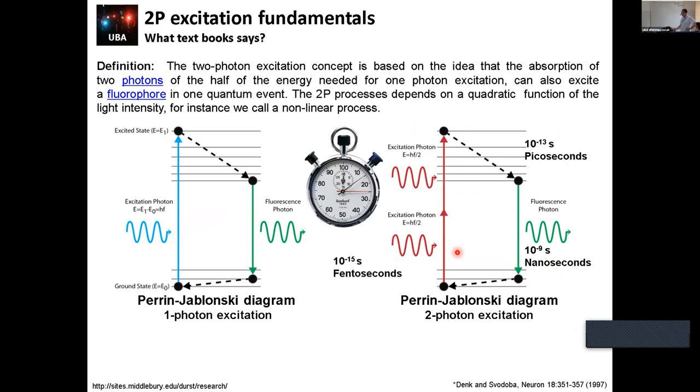Well, if you understand that for excitation with two photons we need femtosecond time, this matches with the length of the pulse that we have in two photons. Our pulse broadening is on the order of 100 femtoseconds or less. So we really compress the photon in a time scale. And this is one of the important points. The other important point is to concentrate that energy, and this is spatial compression.